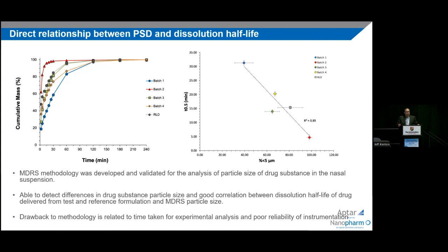The other thing which I just want to highlight is that these runs are long. And what we've noticed is there are system reliability issues, particularly with the laser failing. Nicholas mentioned the XY tracking, sometimes that fails. So there are robustness issues, which, as this is going to be used further in the future, is a point for us as a community who are using this to really address. And that's something I'll leave as a point for discussion.